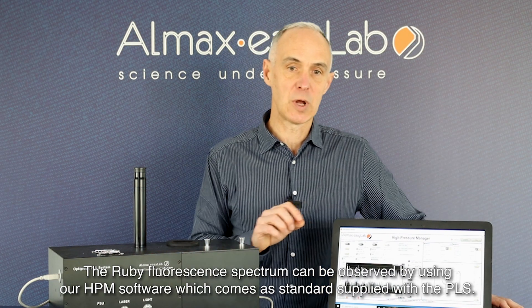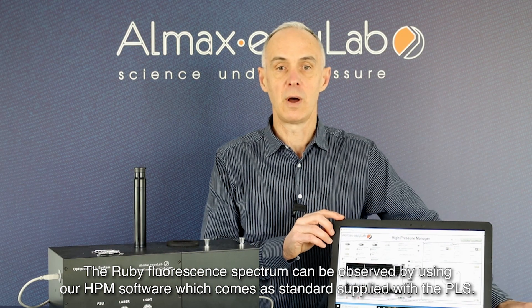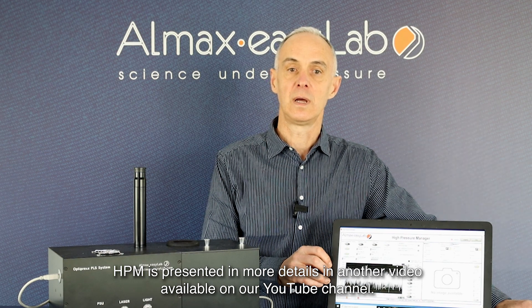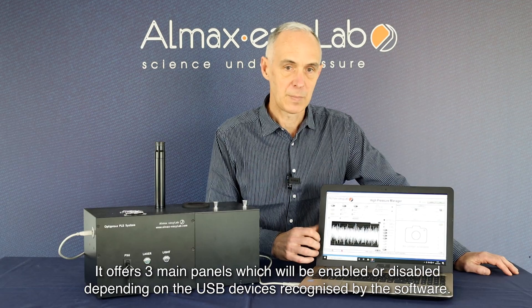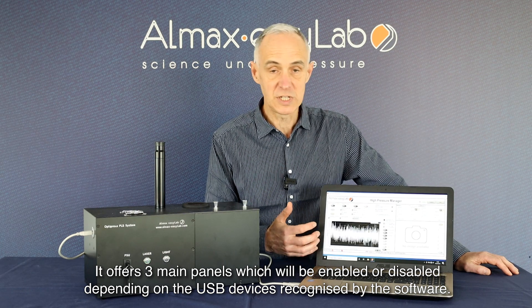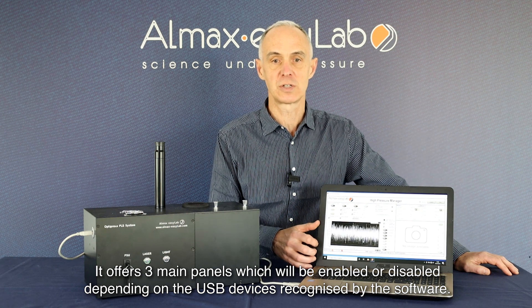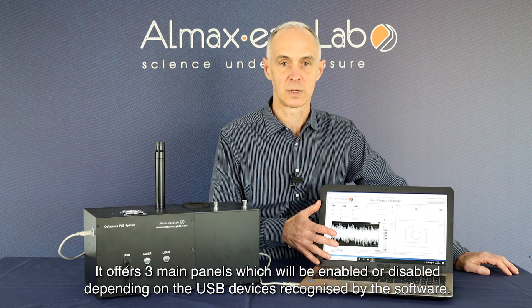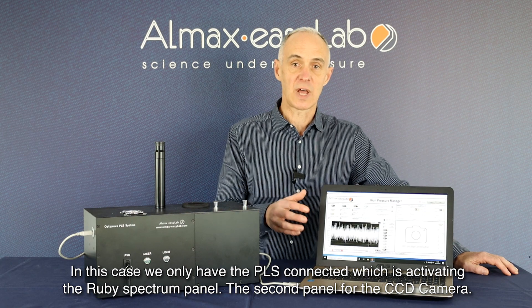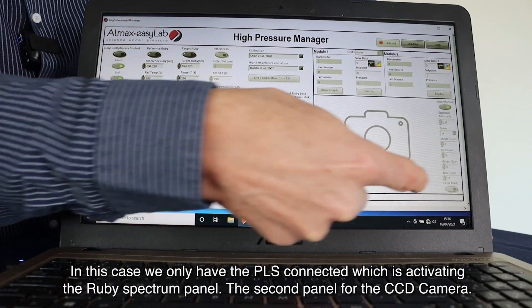The ruby fluorescence spectrum can be observed by using our HPM software, which comes as standard supplied with the PLS or Rubylux. HPM is presented in more detail in another video available on our YouTube channel. Basically, it offers three main panels, which will be enabled or disabled depending on which USB devices are recognized by the PC and the software — this is done automatically. In this case, we only have the PLS connected, which activates the ruby spectrum panel and the CCD camera panel; the IGM panel is deactivated because that device is not connected.